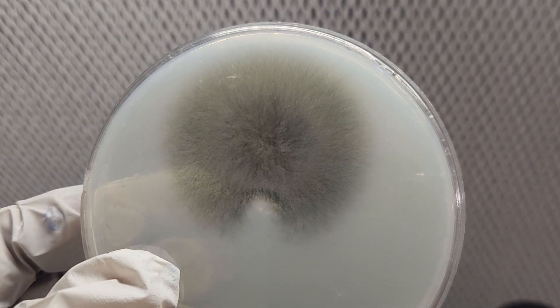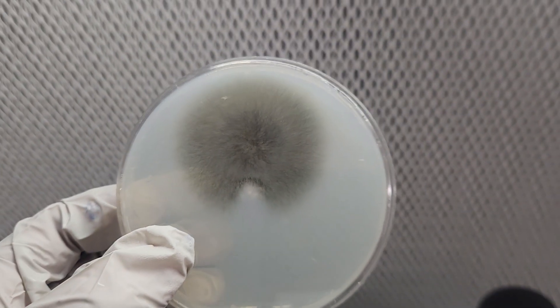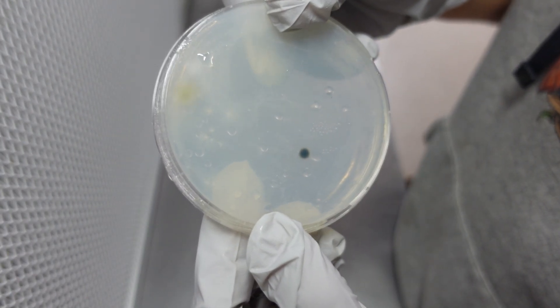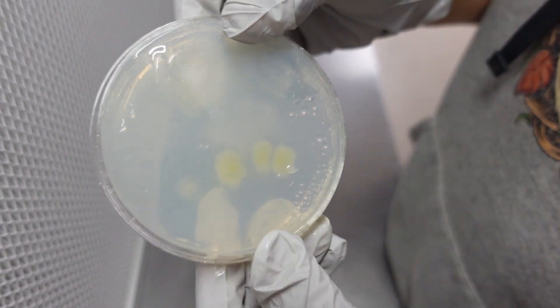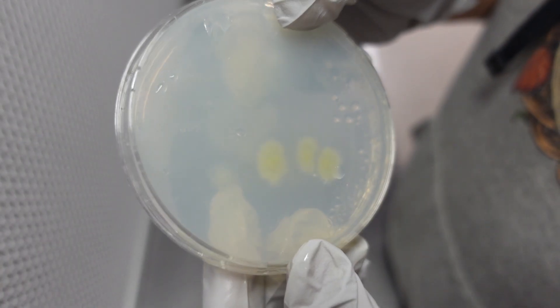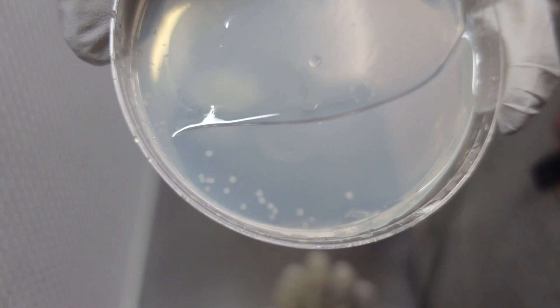If any plate is contaminated and the spores have not yet germinated, it is best to discard the plate to avoid spreading the contaminant. If you see any germinated plates that are contaminated, you will need to transfer a small piece of mycelium to a clean plate. Here are some examples of contaminated plates. These greenish and black contaminants are filamentous fungi, while these pale dots are typically bacteria or yeast.